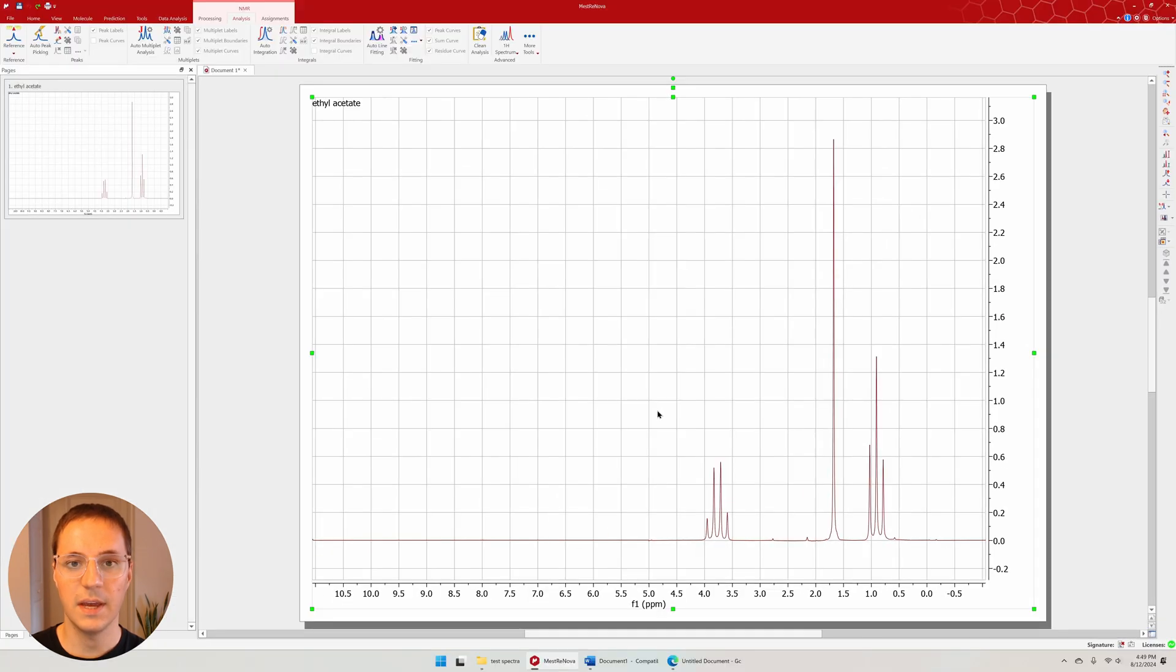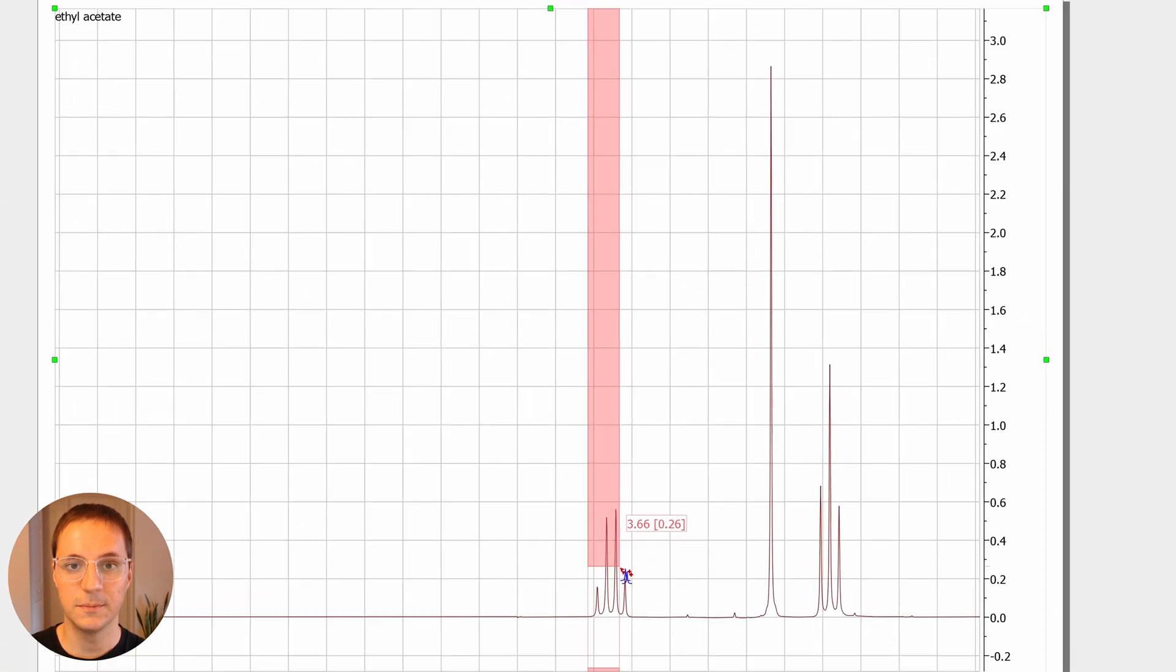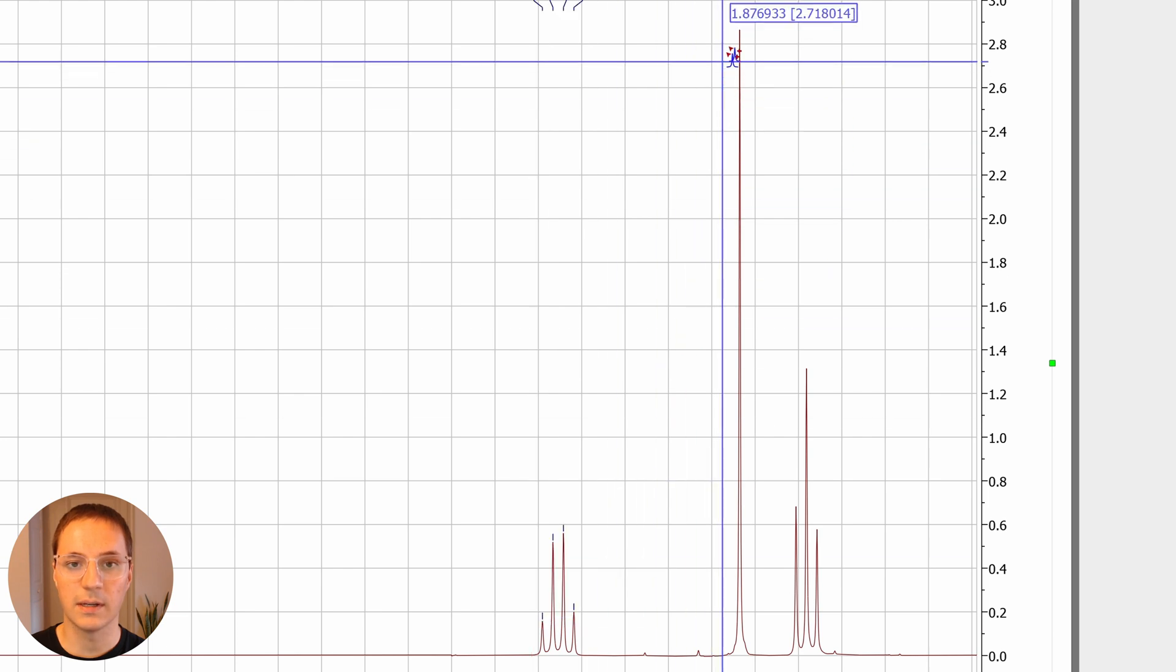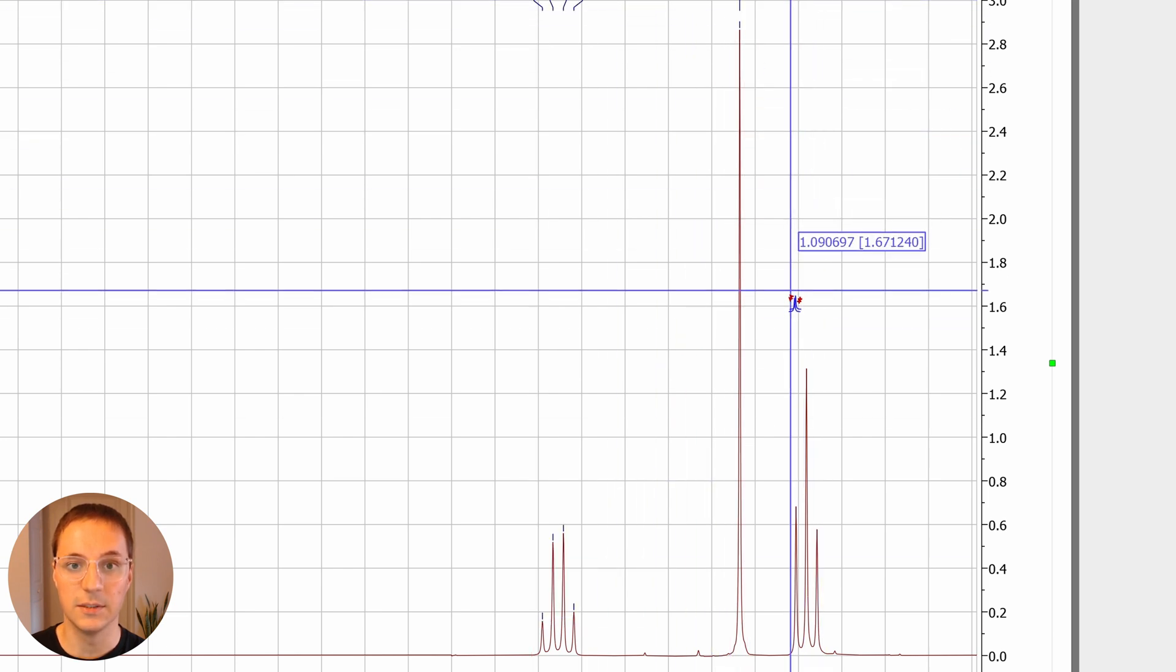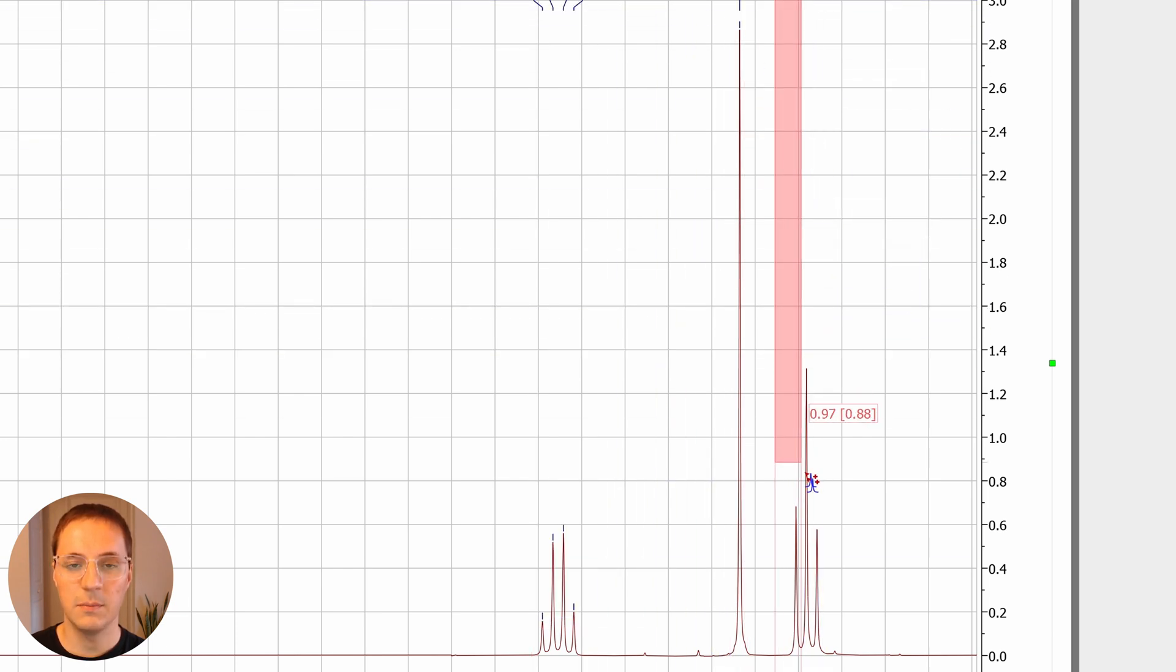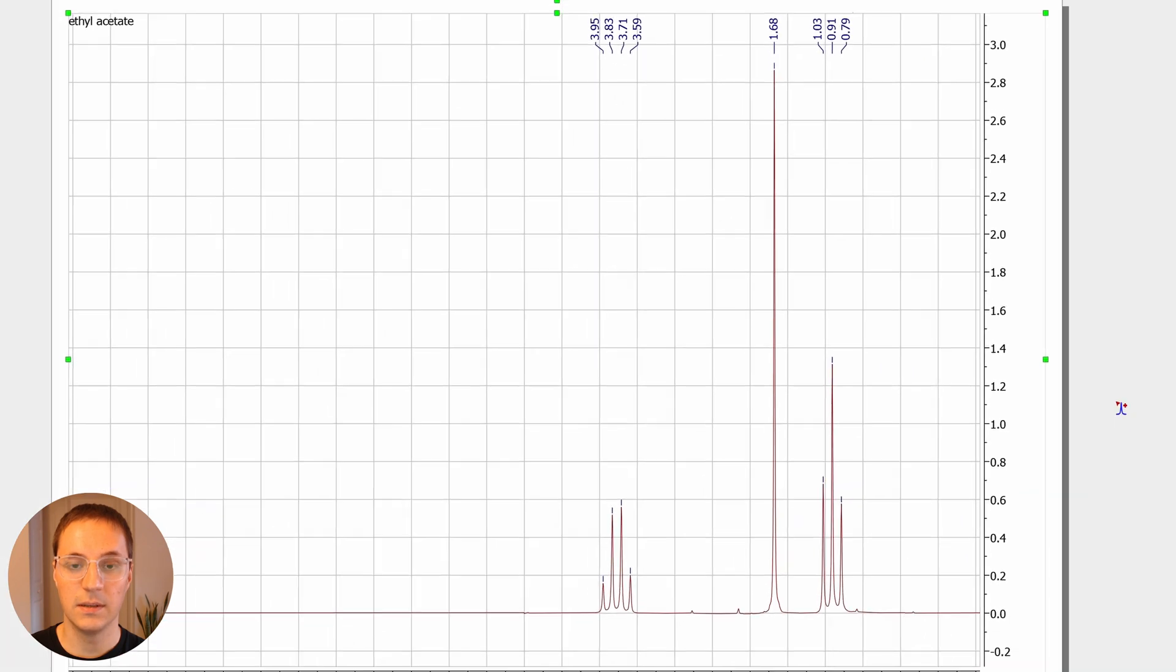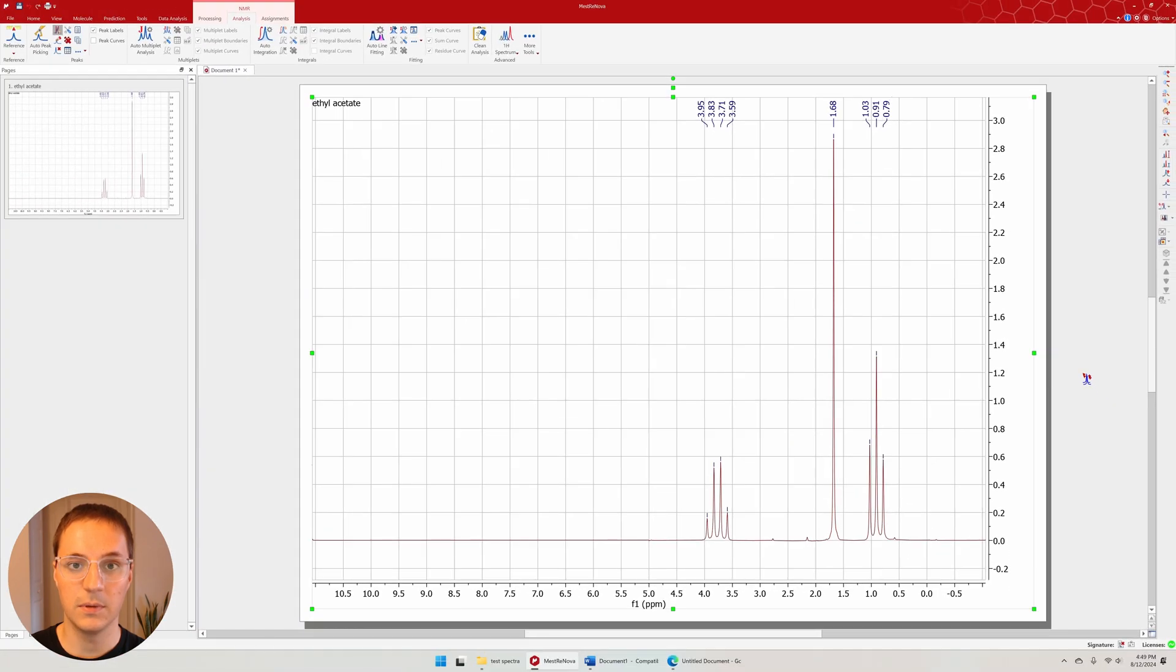Press K to enter the peak picking tool. Click and drag to form a box around all the peaks in each signal. If the bottom of your box doesn't touch the peaks, they won't be labeled.